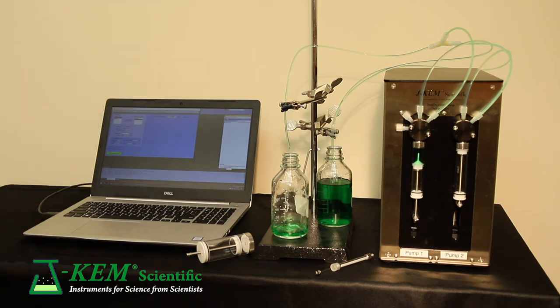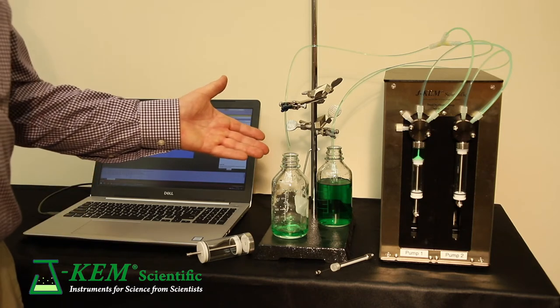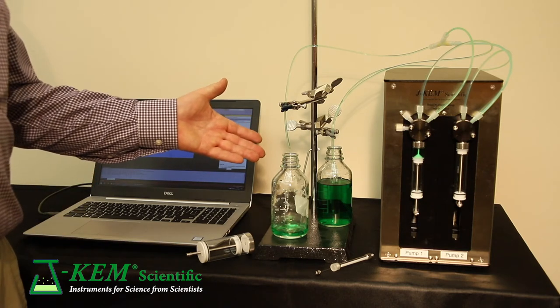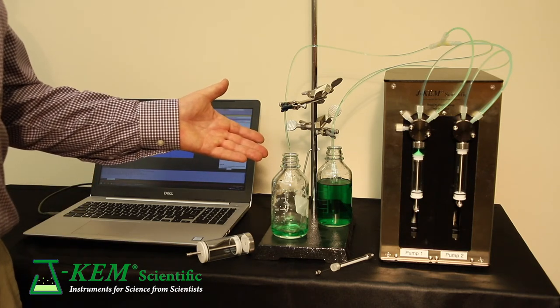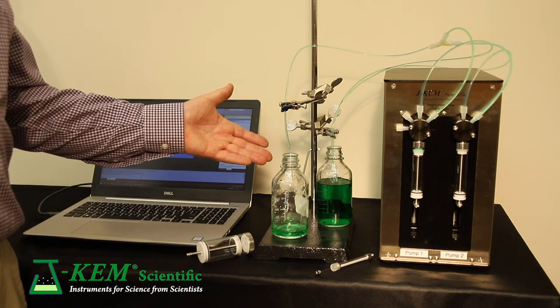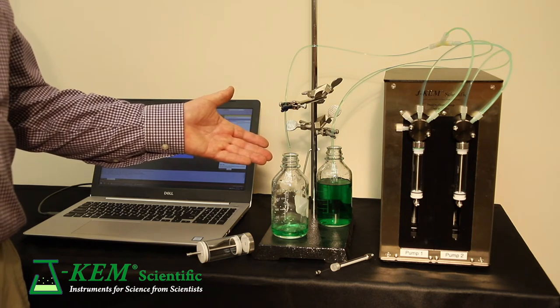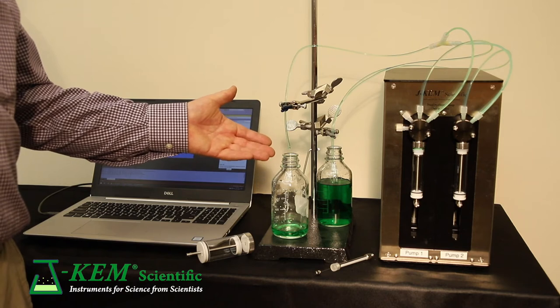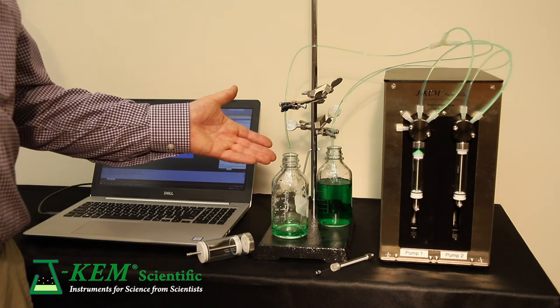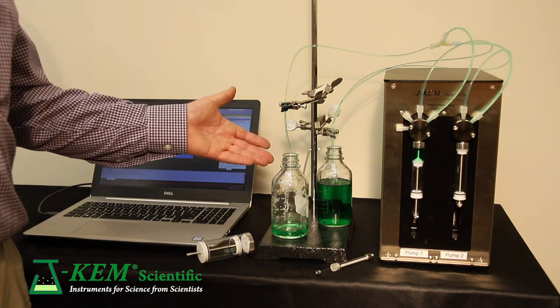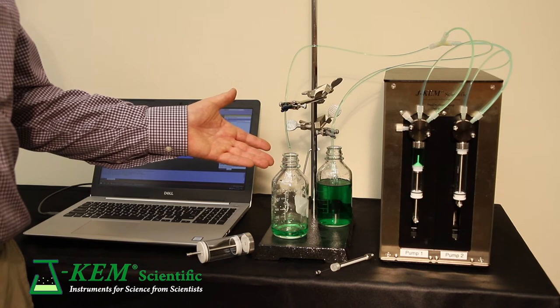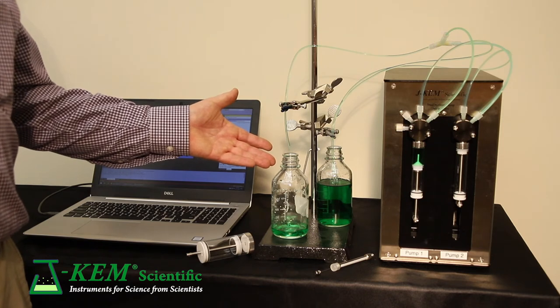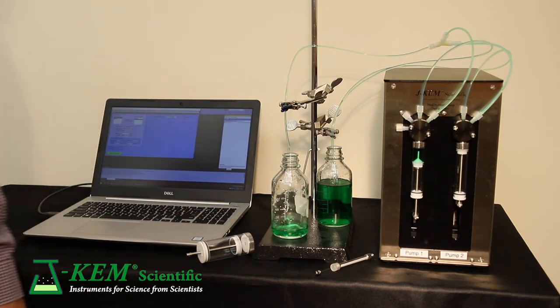But watch what happens when it needs to refill again. Right now it is dispensing at the requested rate of 10 milliliters a minute. But when it needs to refill, the dispense will stop because there's only one syringe. Once it's full, it will resume its delivery.